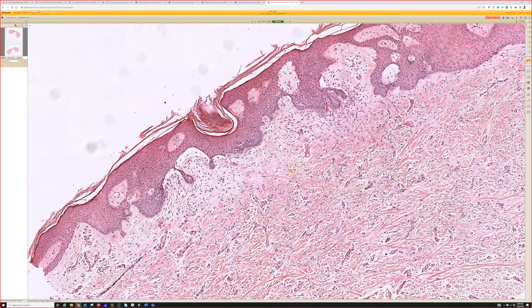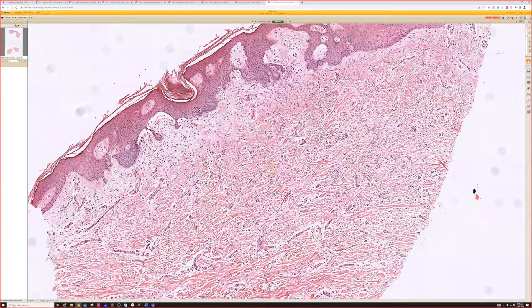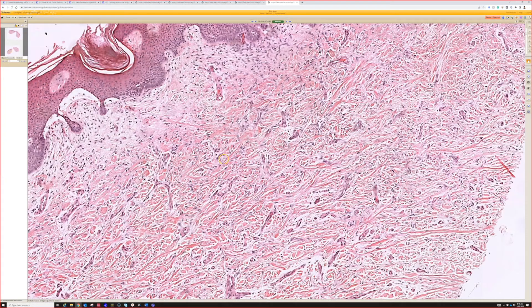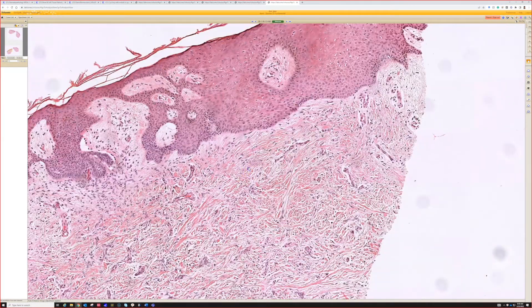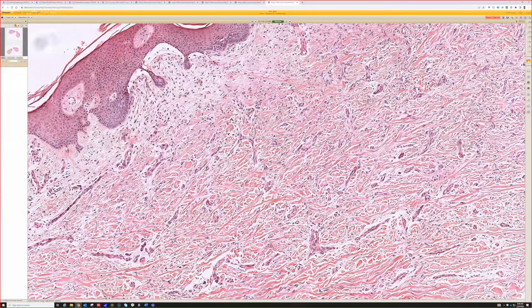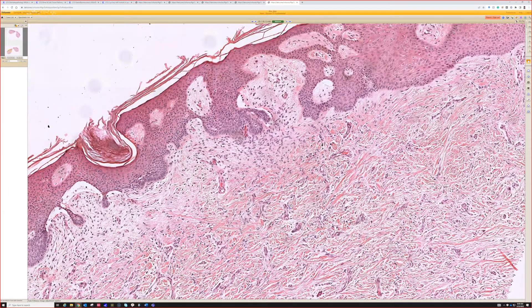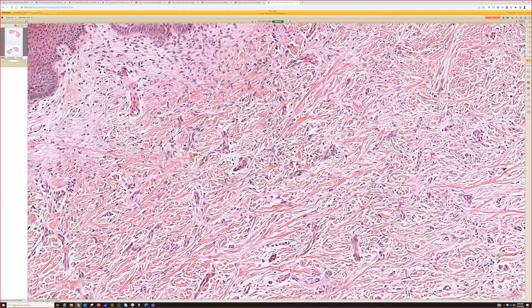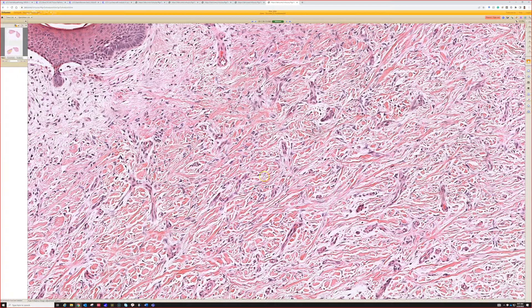You can see that it's cellular and there's a proliferation of cells, but this would definitely be something that has a differential because it's not like others that we've seen. We could go through the busy dermis differential and look at a bunch of things like a Spitz nevus, a blue nevus, a granuloma annulare, dermal fibroma — and we're still going to consider dermal fibroma here.